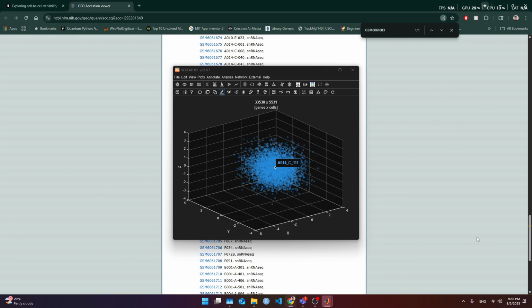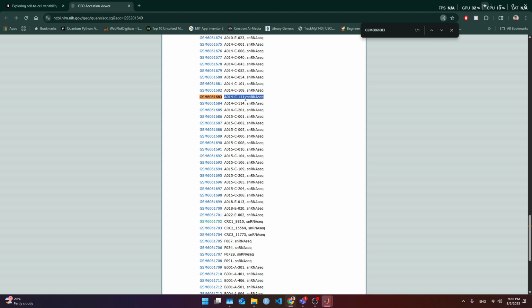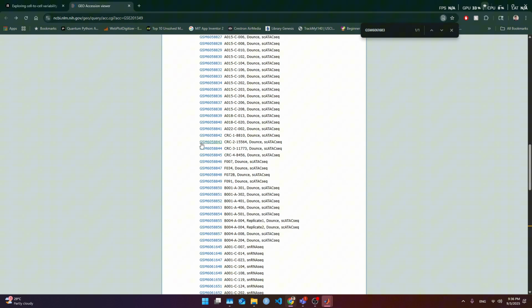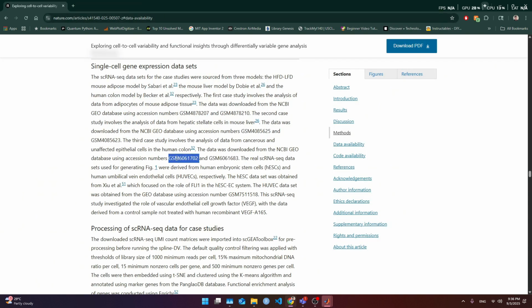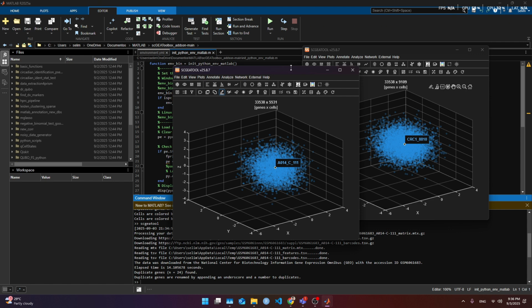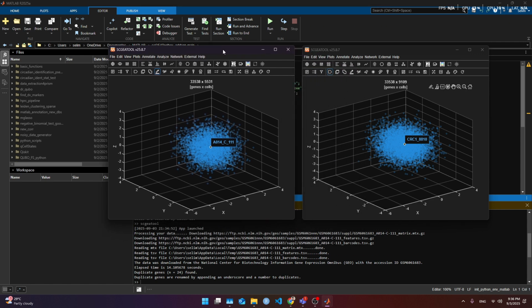And here, what I'm gonna do, we can just disregard this web page where you can look for more data sets. This is just one example that I retrieved from this paper. And so far, so good. The first thing we can do is save a copy of this, so we don't have to download and wait for it because it takes some few minutes.